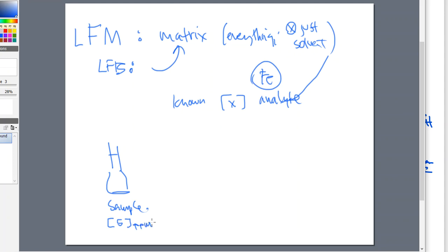Parts per million. Okay, then what would happen is that prior to running it, I have taken a portion of that sample and put it into a different container, maybe a volumetric flask. And I have added a known amount of iron into it. Okay, I know what the concentration of that is. I know how much I've added. I know what my signal response should be.